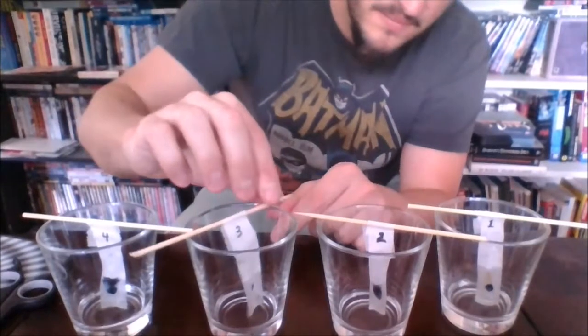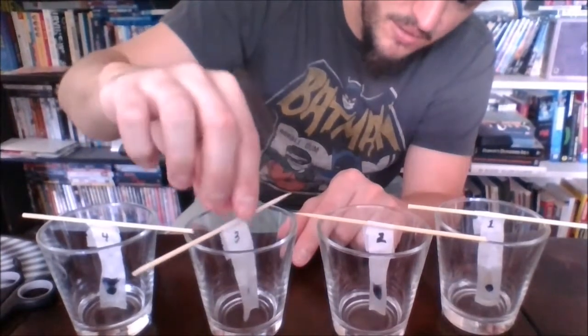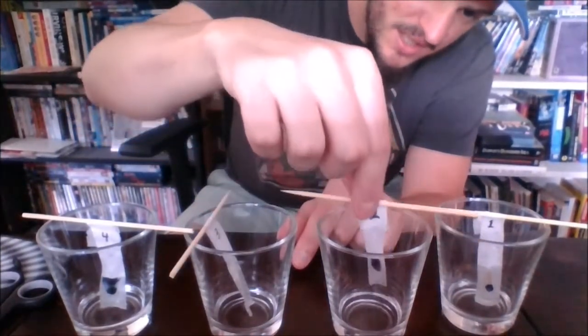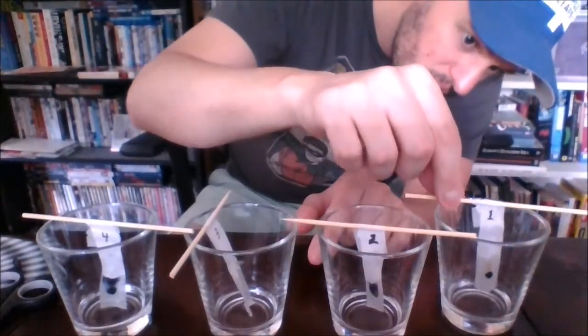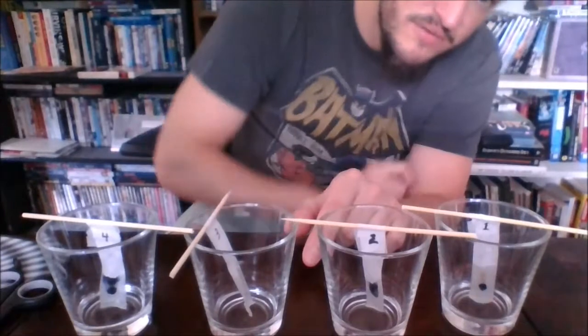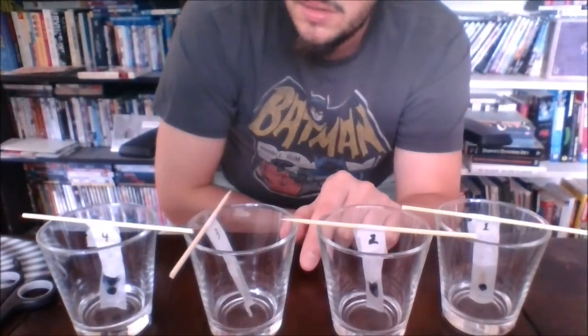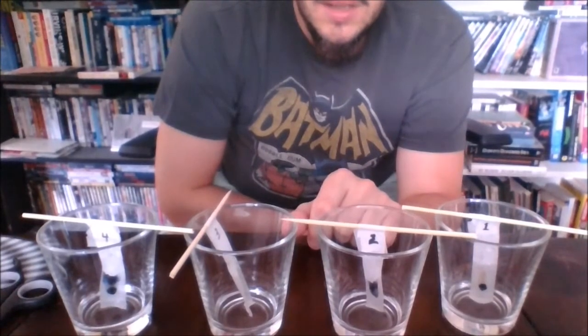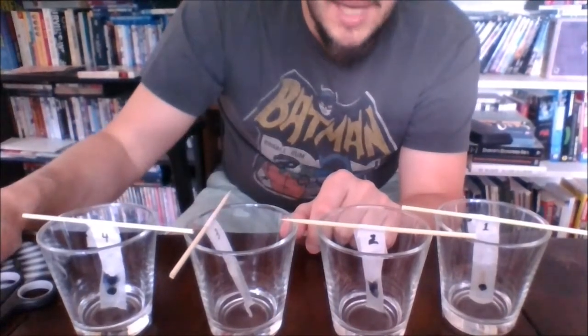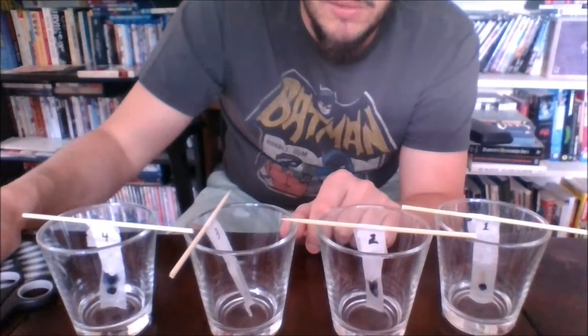Actually, before I stop recording, let's make sure we get a good look here at the Sharpie beginning to turn blue. The gel pen has a streak of orange at the top, which is new and interesting. Alright, I'm going to stop recording, hang these to dry, and we'll take a look again once they've dried out.